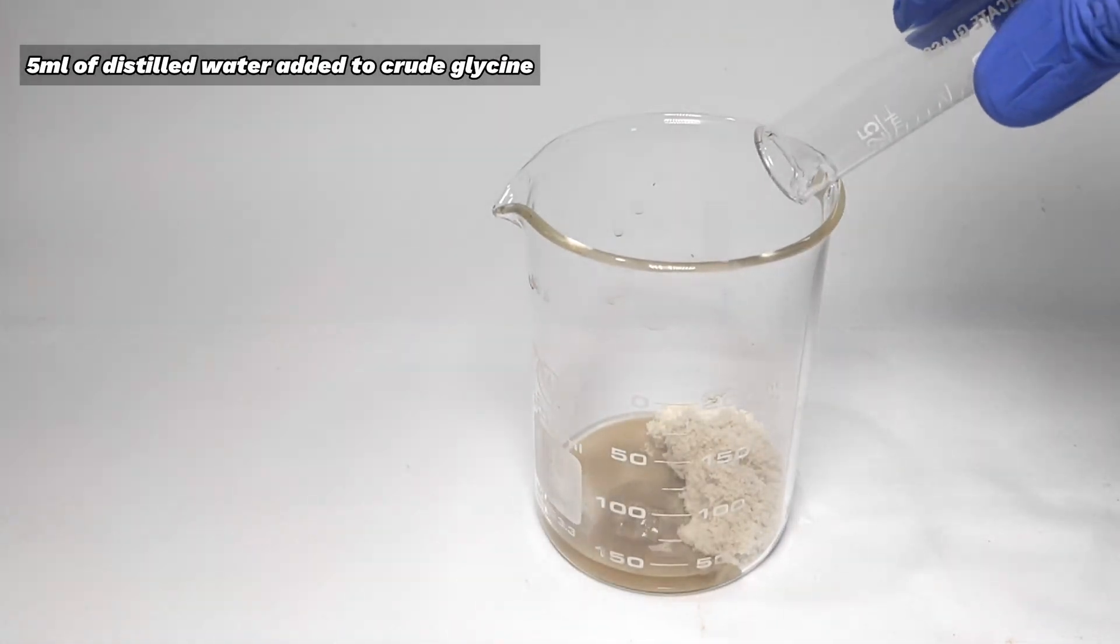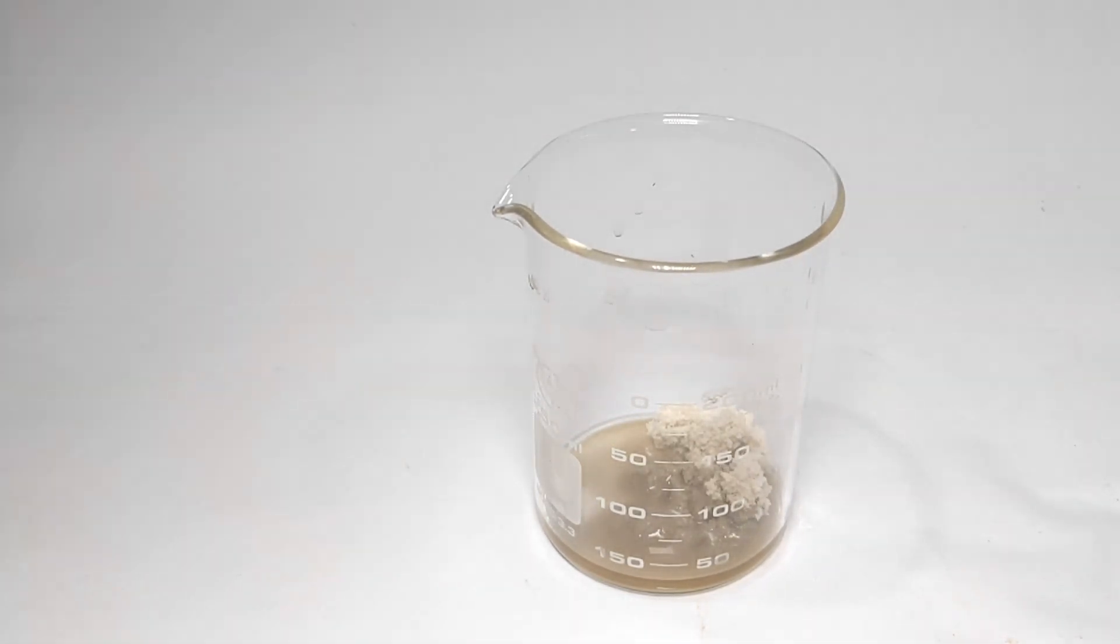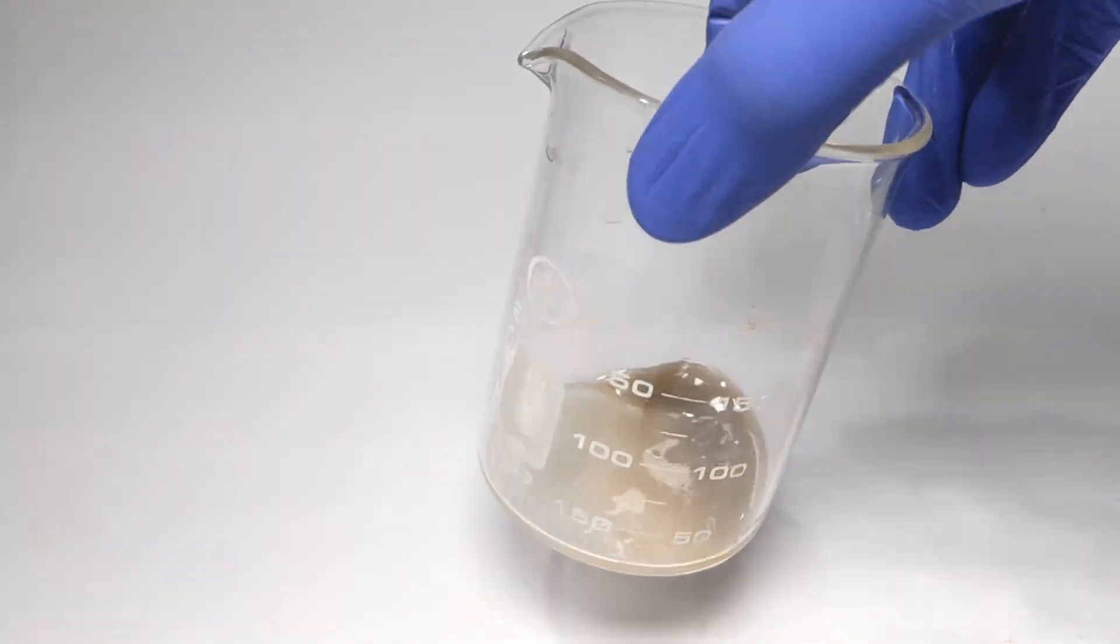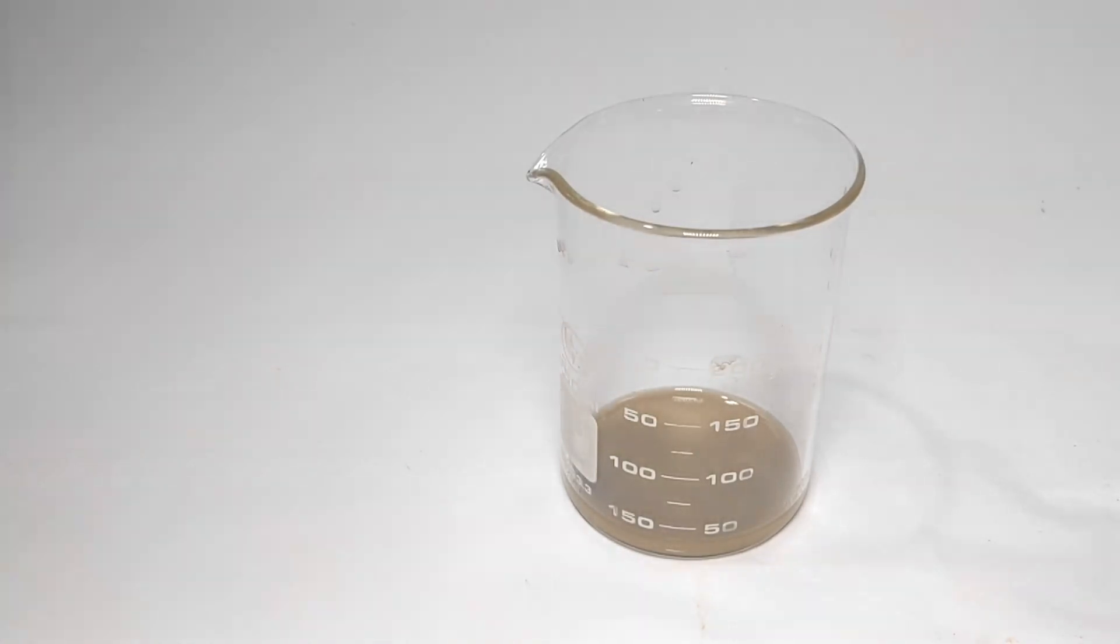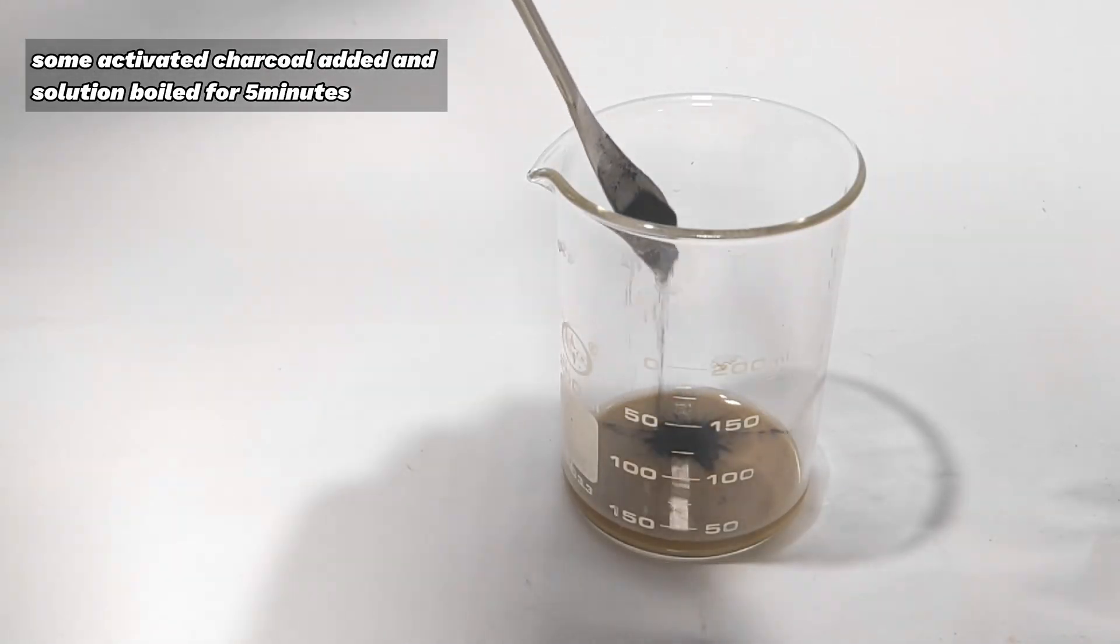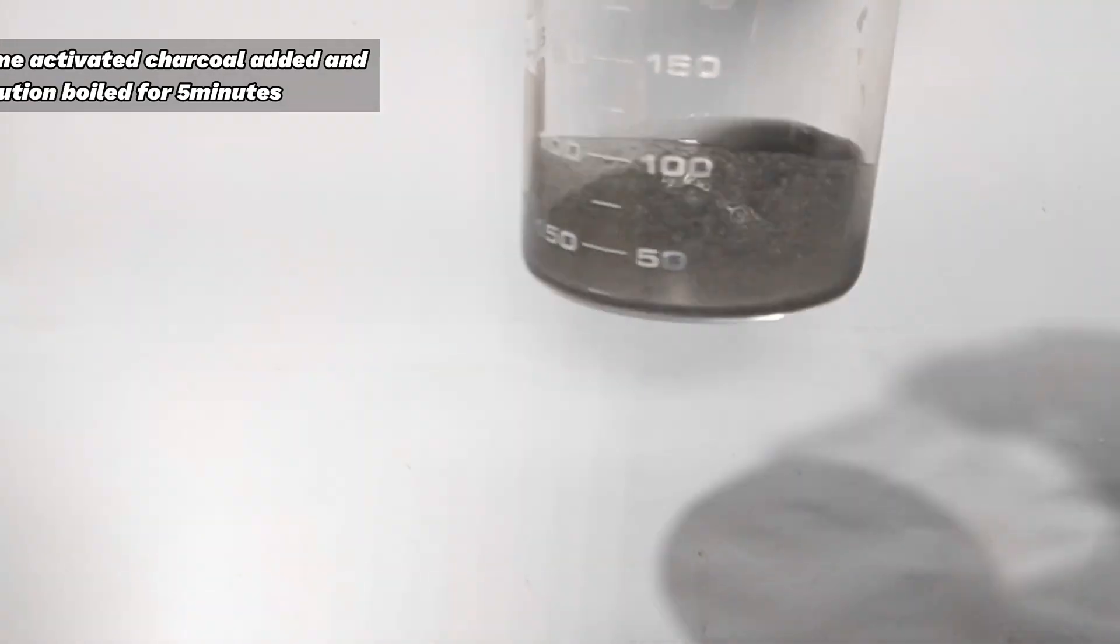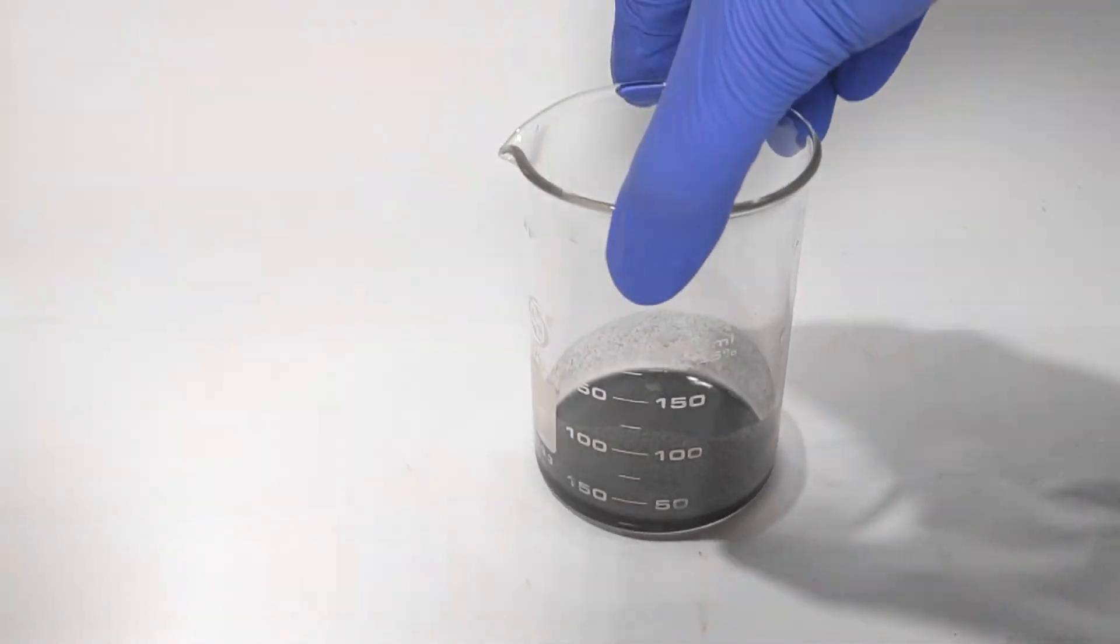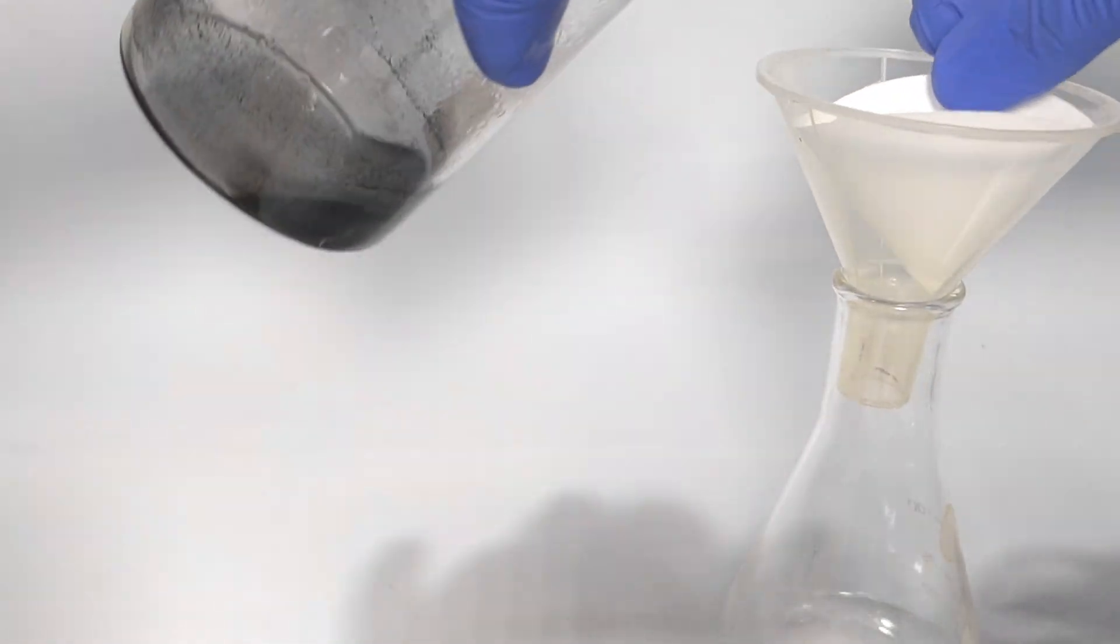For that, 5 milliliters of distilled water was added to the compound. Glycine is highly soluble in water and everything dissolved and a clear dark solution was obtained. Now a few grams of activated charcoal was added and the solution was boiled. Then it was filtered. Activated charcoal helps in removing most of the colored impurity and this would make the compound much whiter in color.